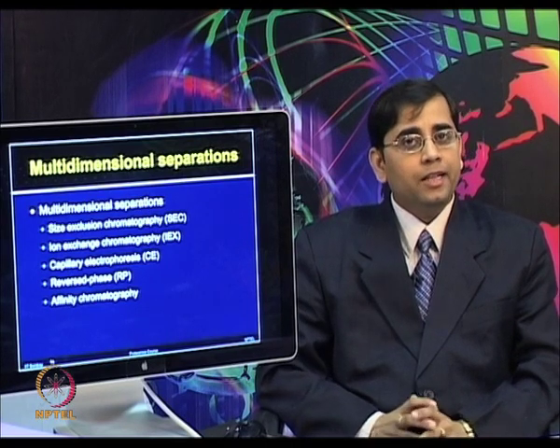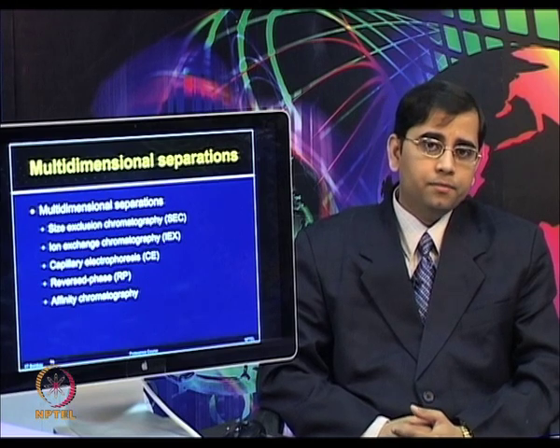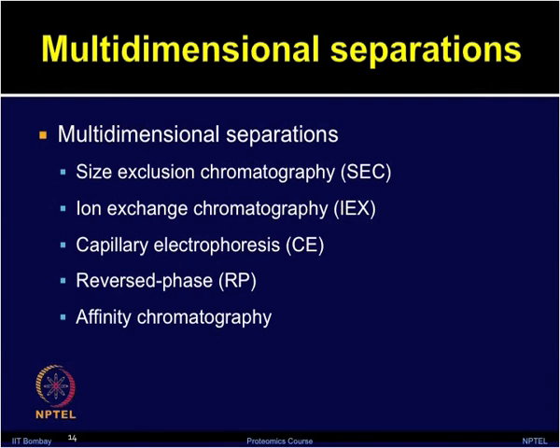Different principles are involved for separating these peptides. One can use size exclusion chromatography, which separates based on molecular weight or size, ion exchange chromatography based on the charge, capillary electrophoresis based on charge, reverse phase based on the hydrophobicity, and affinity chromatography, which is based on the biological interactions.